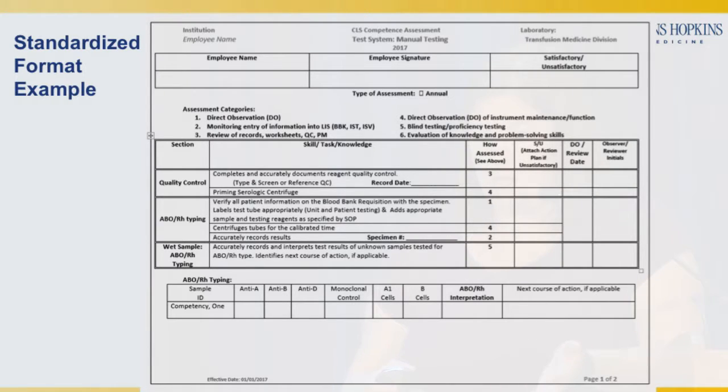Oops, I hit a button I didn't expect. Okay, sorry. You don't actually have to watch them do QC necessarily, because that would be a review of record. But I just want to show you, up here at the top, I've defined what my test system, my competency assessment systems, are. Then when I come down here, I've literally just put a number by it, and I've broken everything down into their pieces.